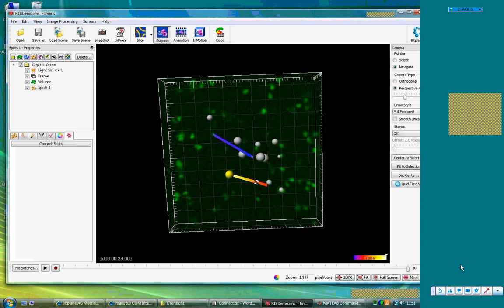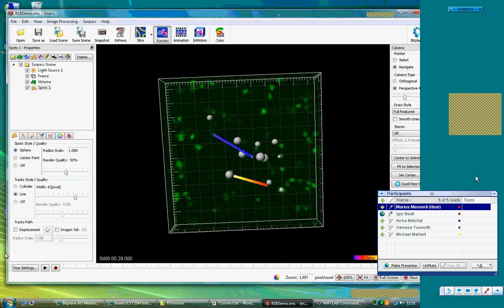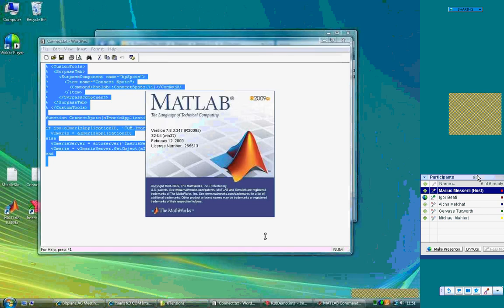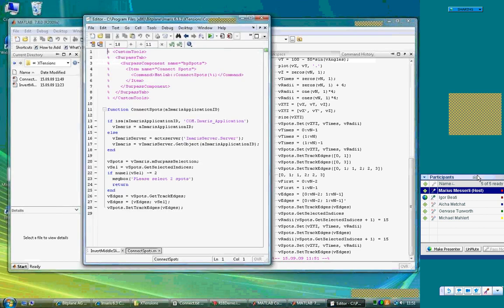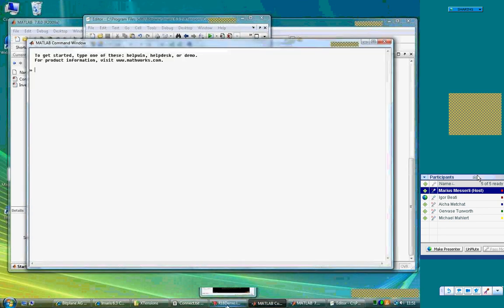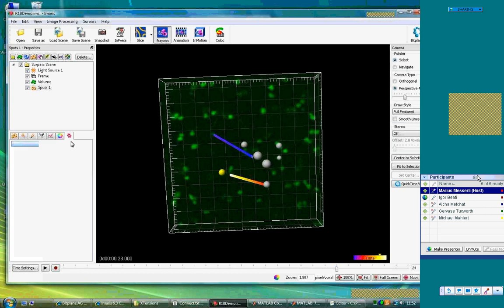Okay. So I prefer to work here in MATLAB because, switch to the right folder, because here if you do some changes, for example a defect of implementation, and you launch it again here, it works because this is not updated.